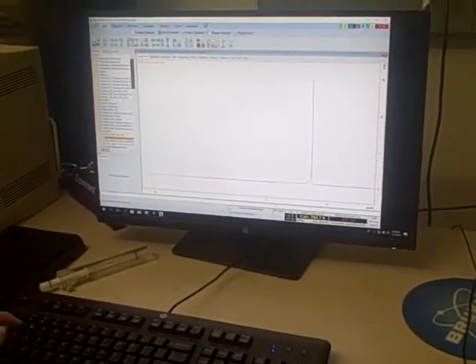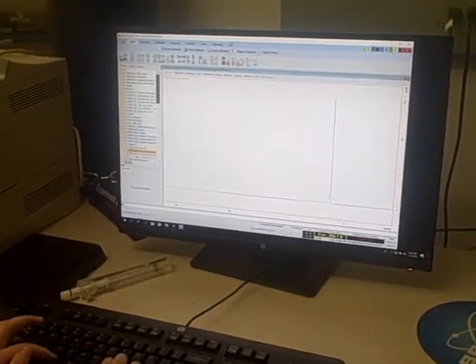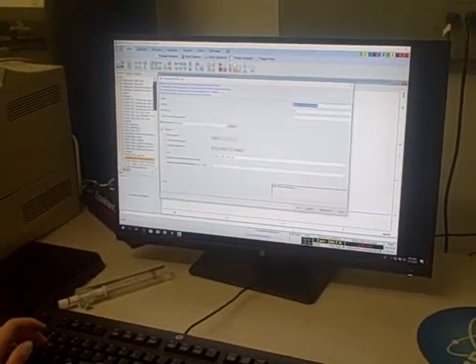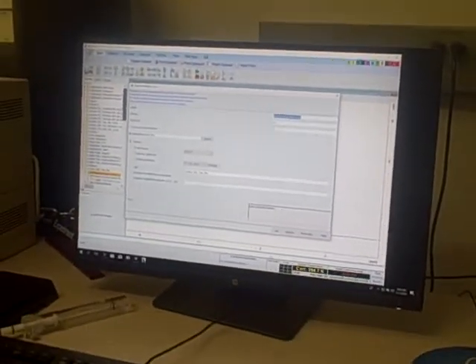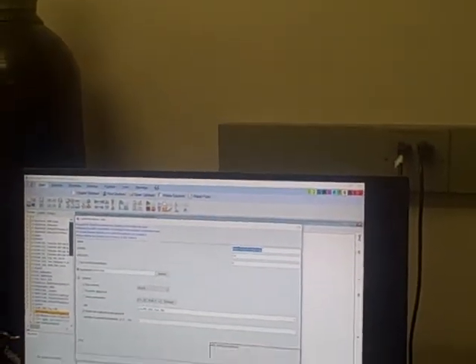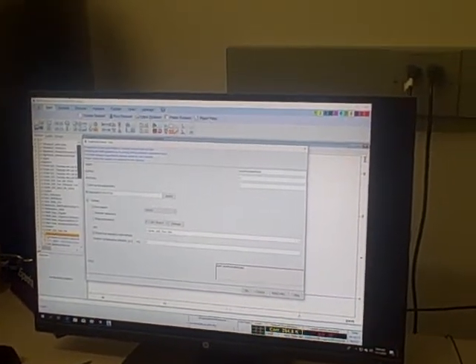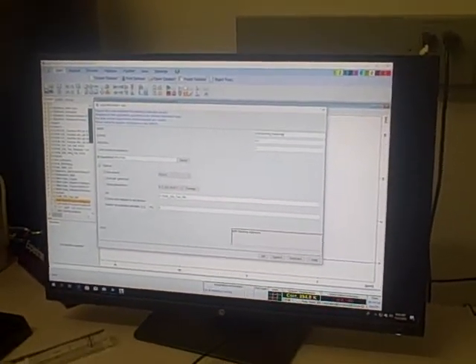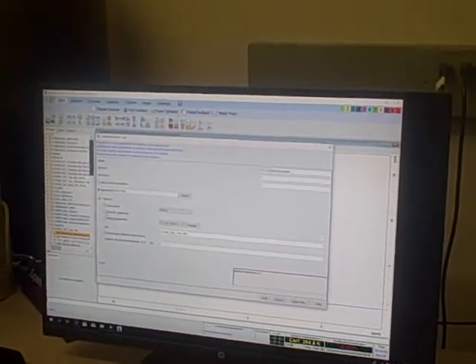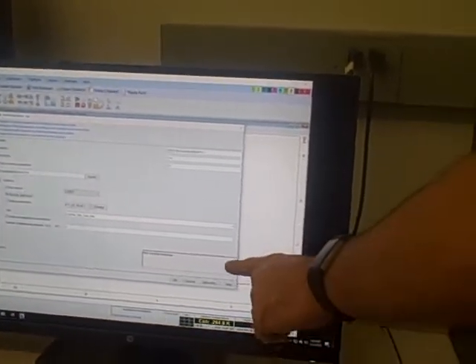After your sample is injected, you're going to want to set up a new experiment by typing EDC, Echo Delta Charlie, into the command line and pressing enter. The first thing you want to do is change the experiment name by including your names and a description of what the material you're taking the NMR of is. Okay. You want to hit the button Execute Get ProSol and change the title of your experiment down here.